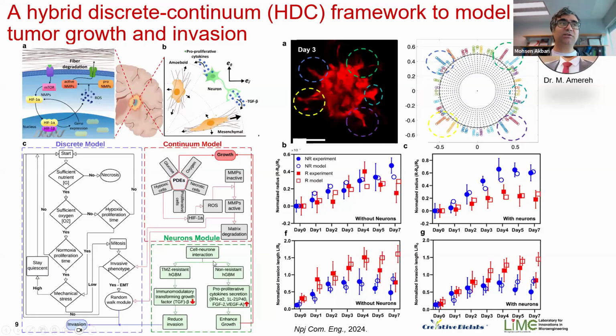Also, one thing about this model is that it's modular, which means that you can add different cells and modules considering their crosstalk with the tumor cells. This way you can add to the complexity of the model by adding different components of the tumor microenvironment, incorporating cell-cell interactions and signaling pathways to study their effects on tumor remodeling.